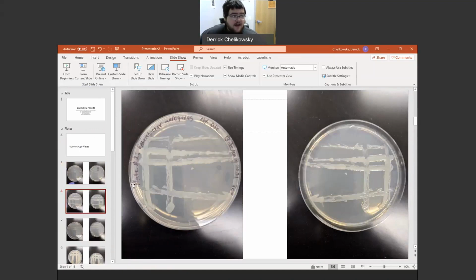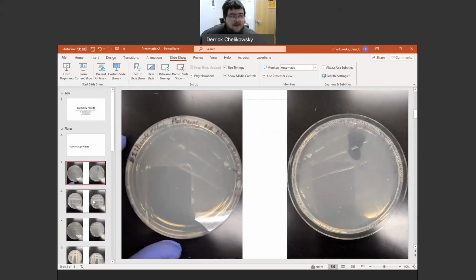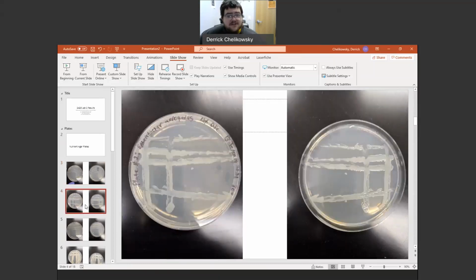Another interesting thing regarding the Enterobacter and the Pseudomonas. Both of them, when they get really strong growths, they change from this clear color that you see on both of them. They change the agar. The Pseudomonas fluorescens is known as Pseudomonas fluorescens because it has a neon yellow color to it. Well, a neon yellowish green color, depending on the strain. I believe ours is more on the green side. It's not really highlighter green, but it's more like a lime green is what it turns the agar and the individual colonies. Whereas the Enterobacter aerogenes is sort of a pink. Because of that, that would be a way to describe it.